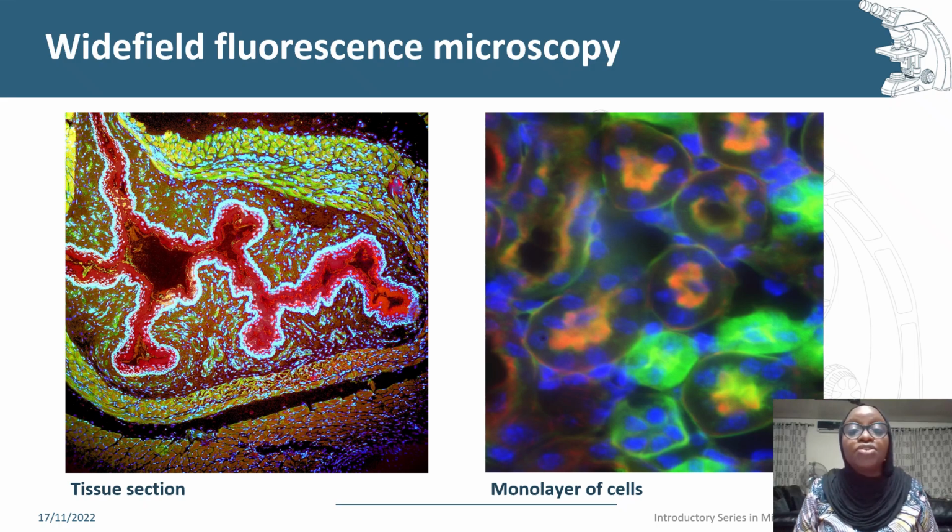Wide field fluorescence does not provide good axial information, as light originating outside of the focal plane will cause the image to be blurry, corrupting the image. This is because out of focus light still reaches the detector. It is important to discriminate light from different focal planes.